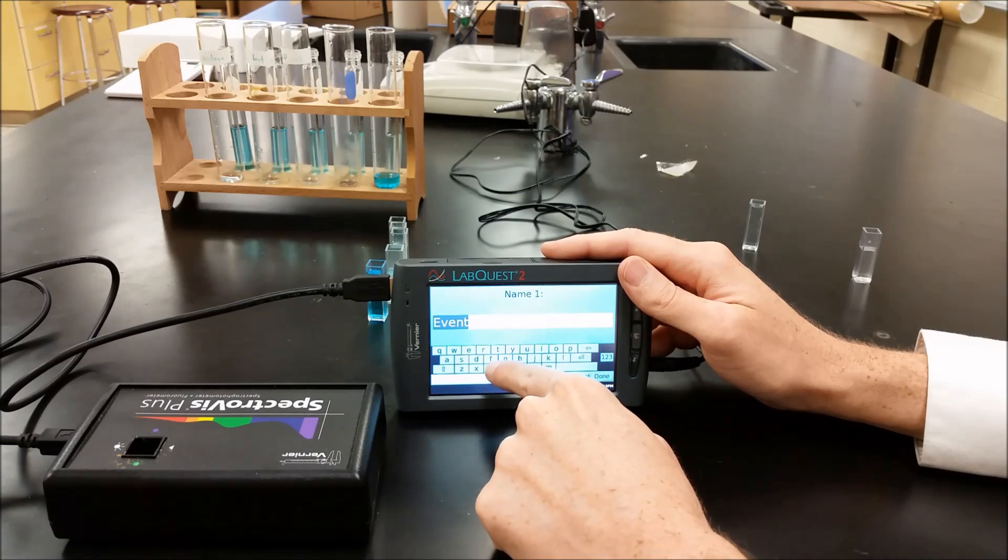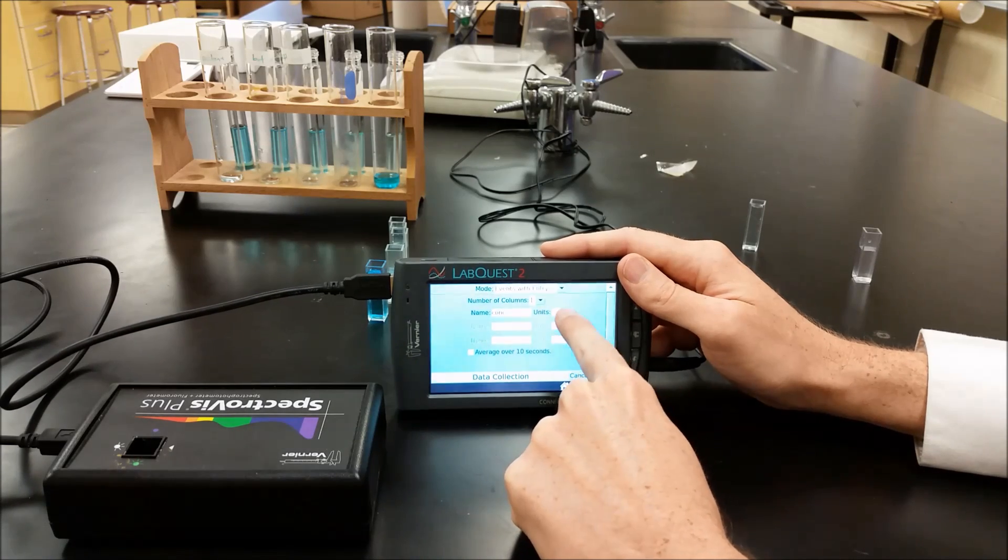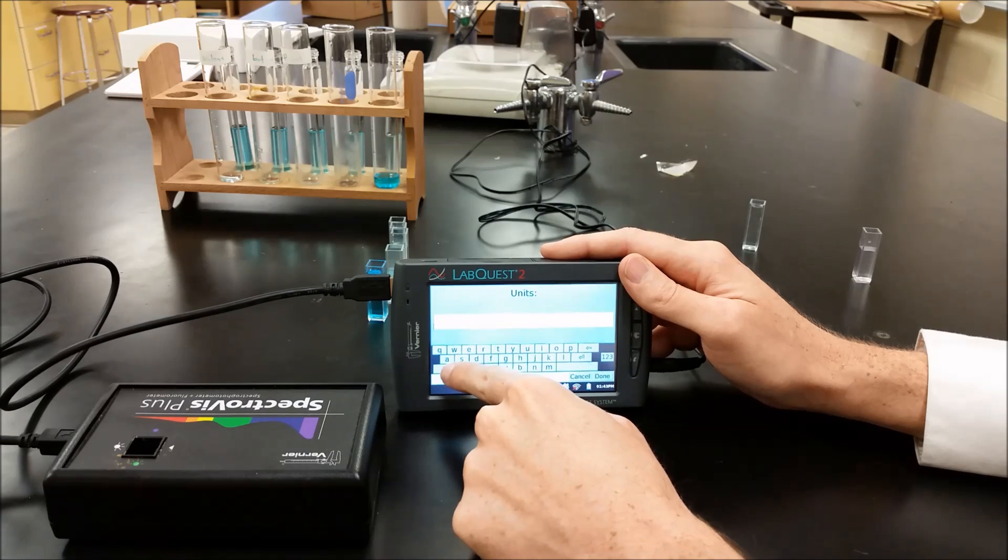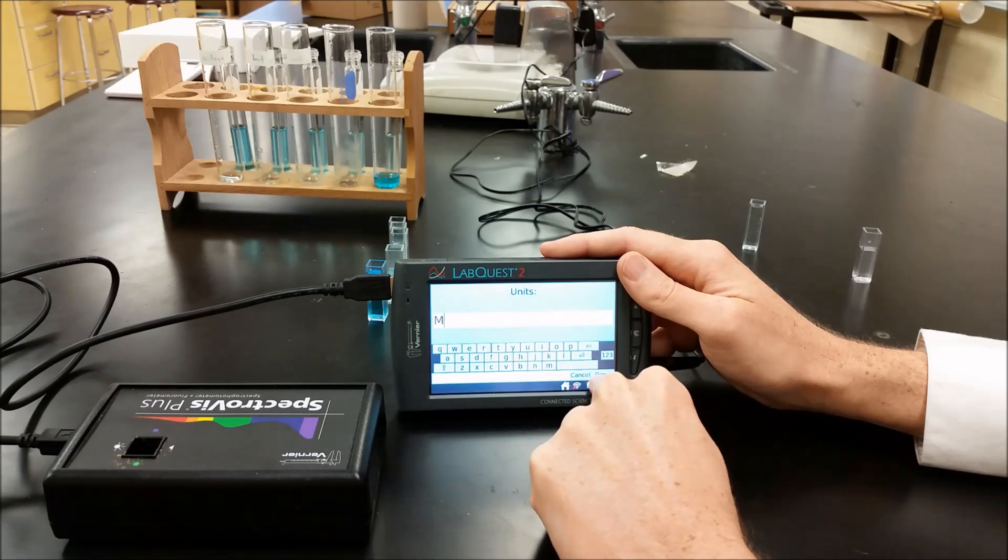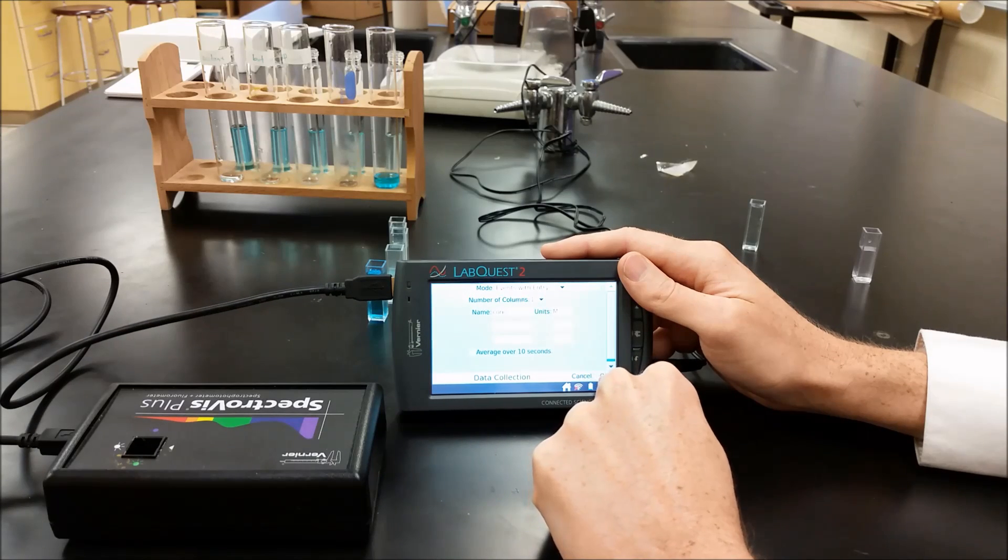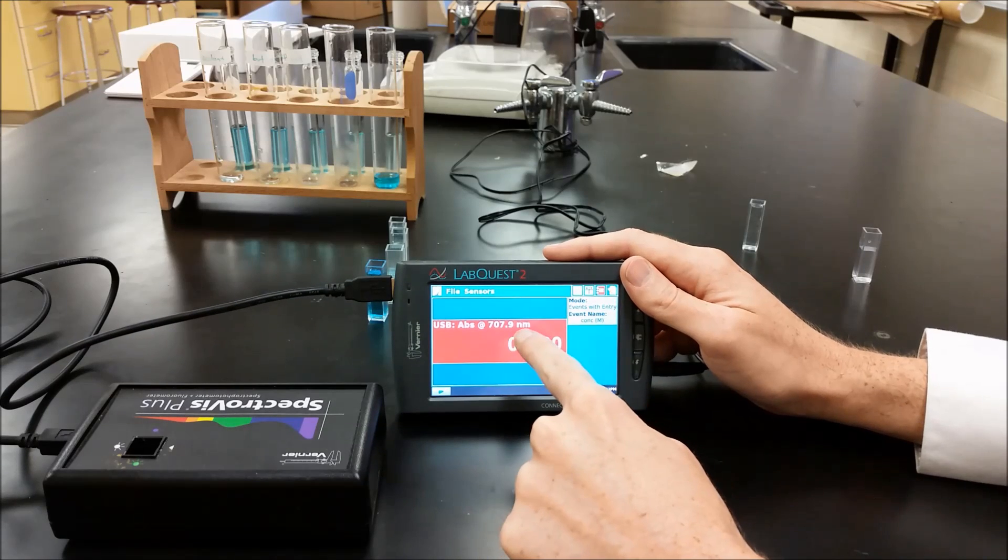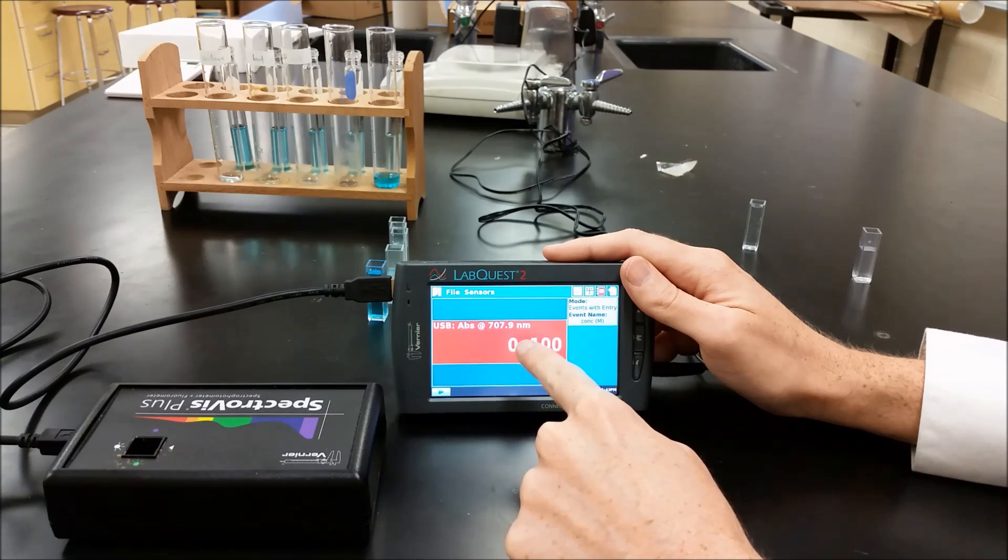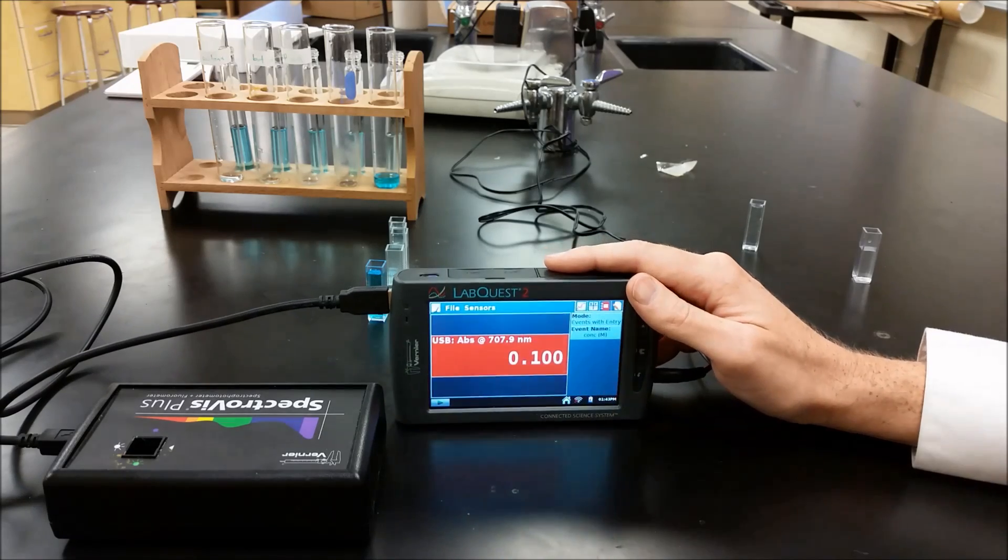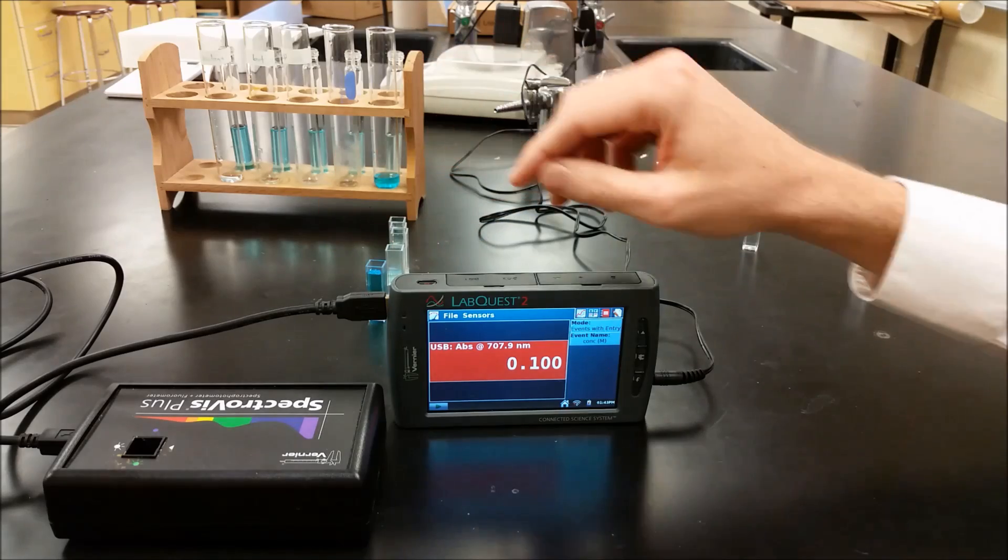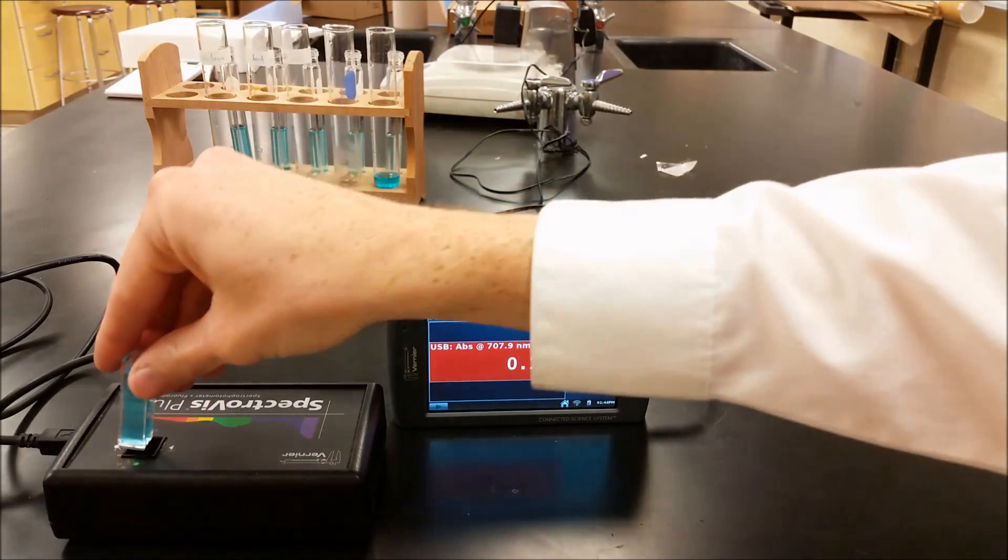And we're going to type in the concentration. And then for our units we can go with molarity. Discard our old data. Now it's got it currently at 708 nanometers which is fine. A little into the infrared range. And every time we put in our solution now it's going to give us the absorbance. So I'm going to take our 0.5 molar put that in there.